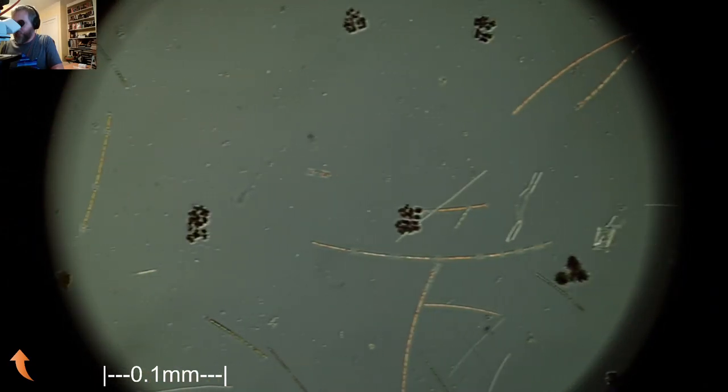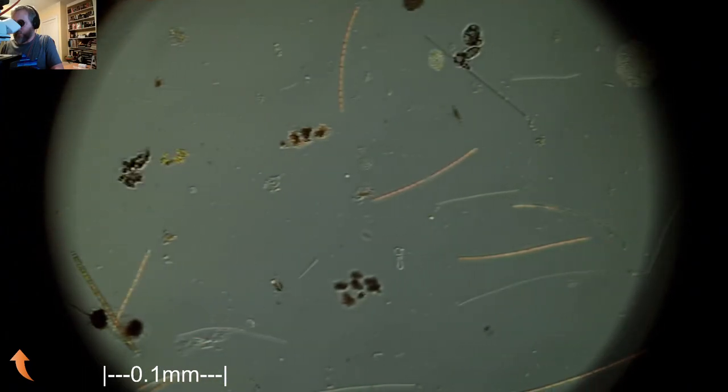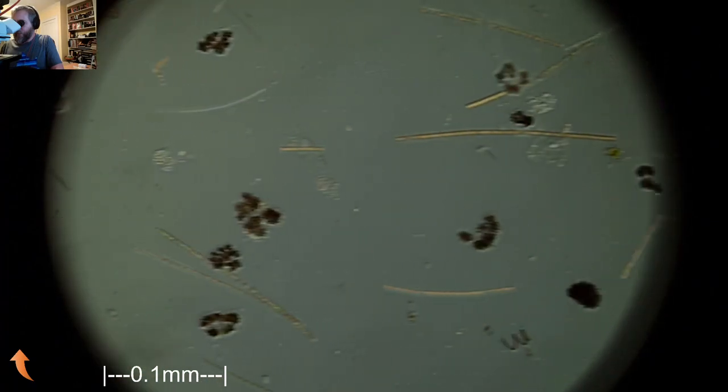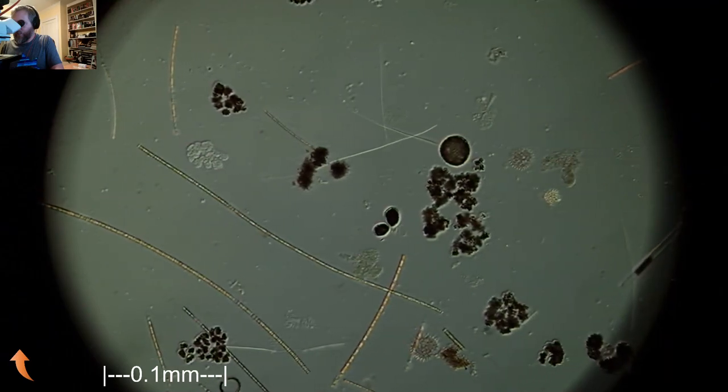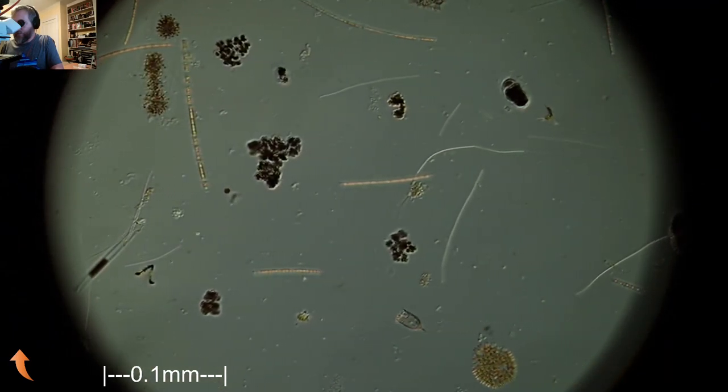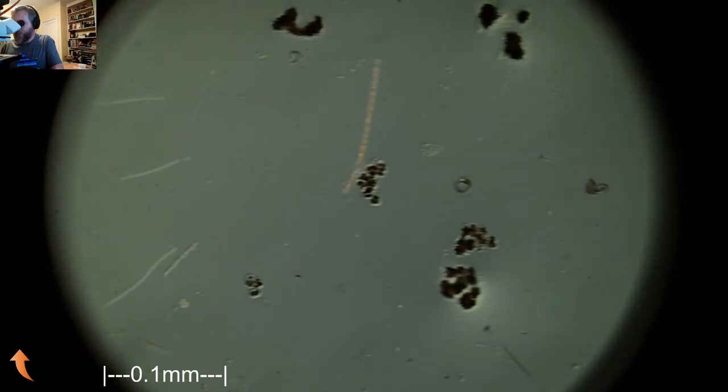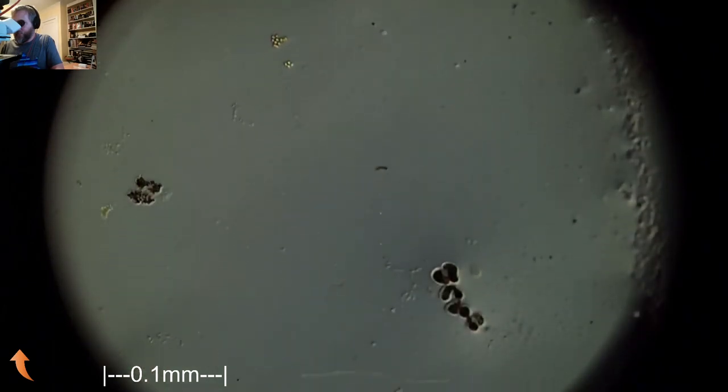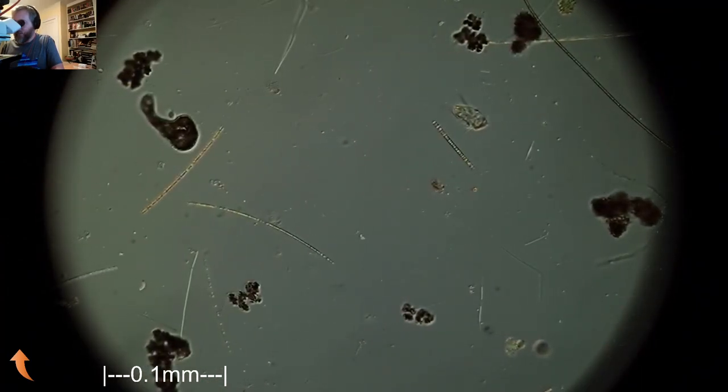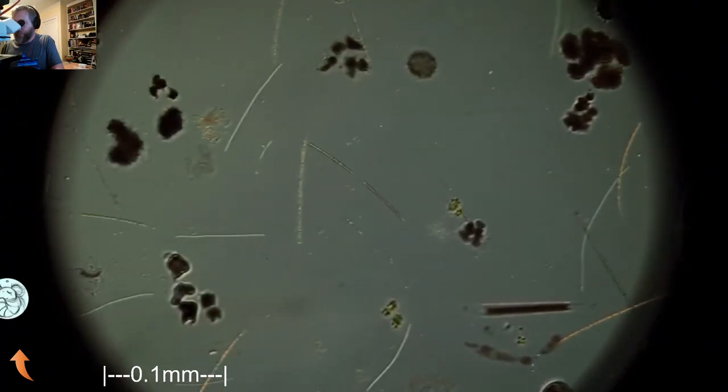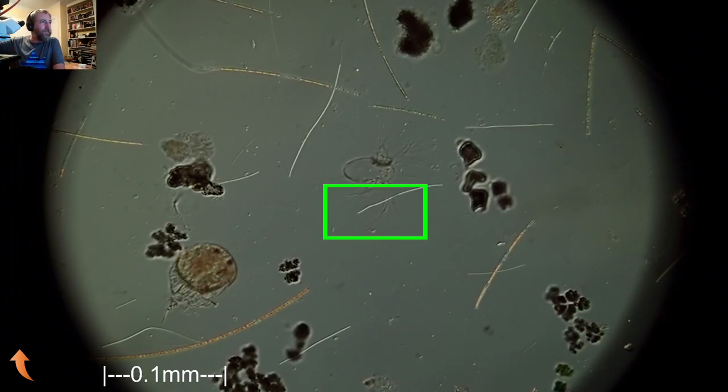There's some pieces of copepod in here as well. And last night when we were looking at these samples fresh out of the cooler, there were some copepod noplia swimming around, kind of knocking our samples around. This one's been sitting out since about four o'clock or something. So it could be that everything in it, all the swimmy things maybe already gone. So there should be some ciliates in here. Somewhere. Hopefully. And a bunch of this algae is still doing fine. A bunch of the diatoms, they don't seem to care. There's a noplius molt right there. Right in the middle. That's a copepod noplius molt.